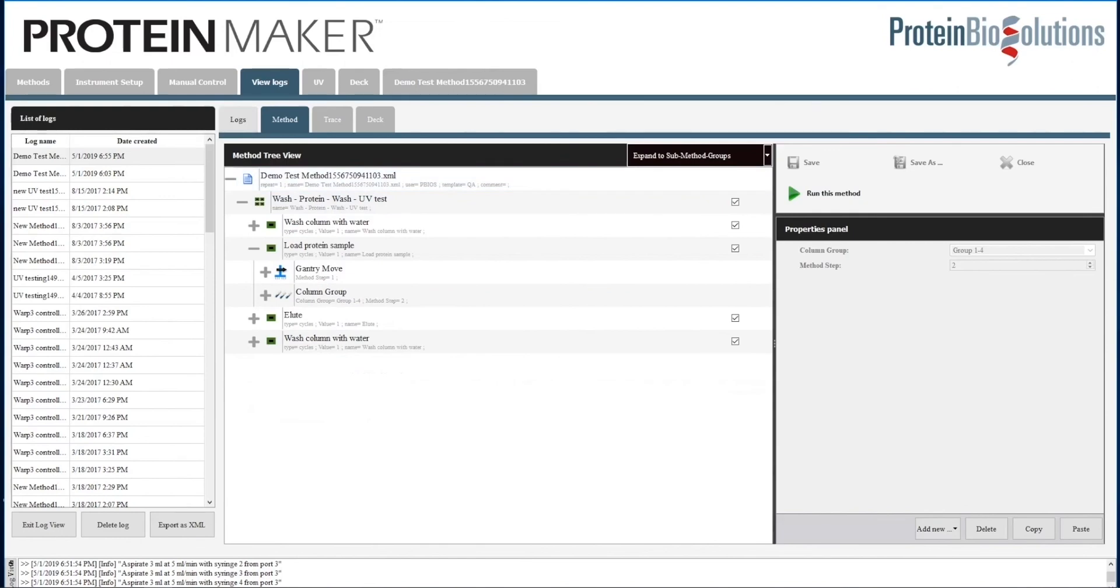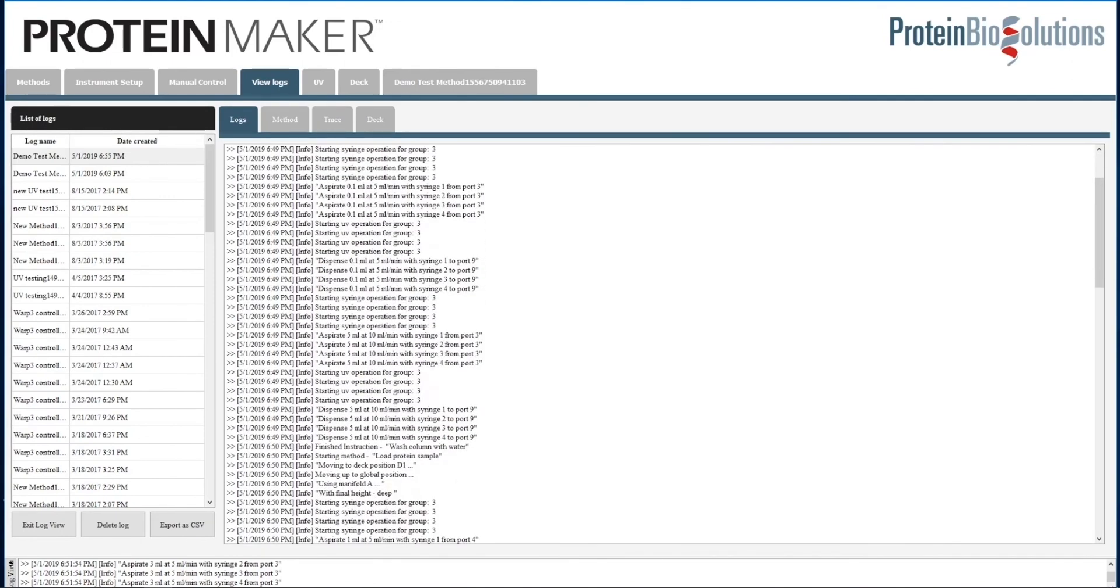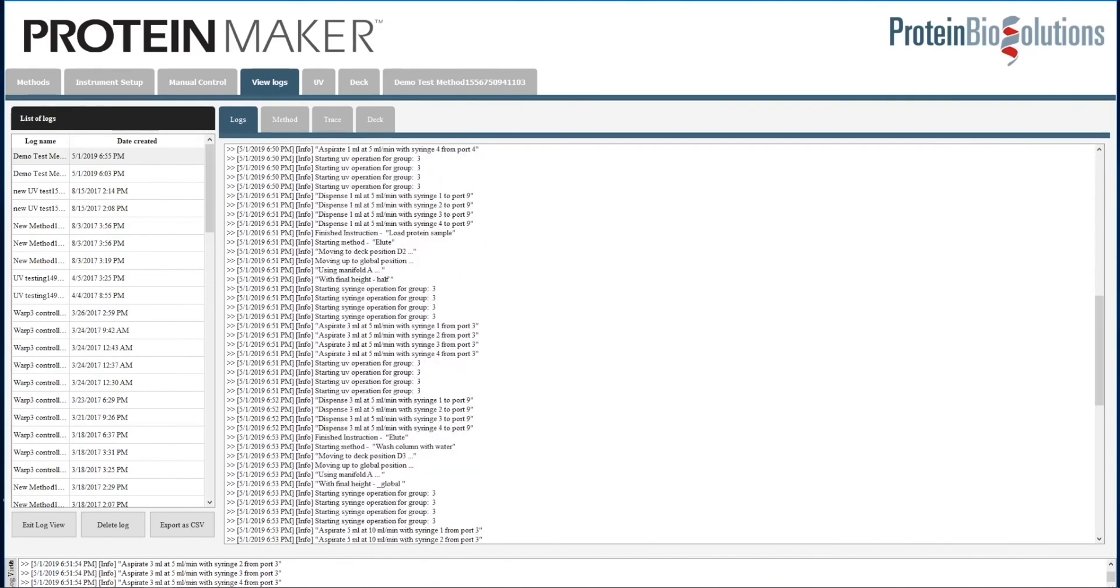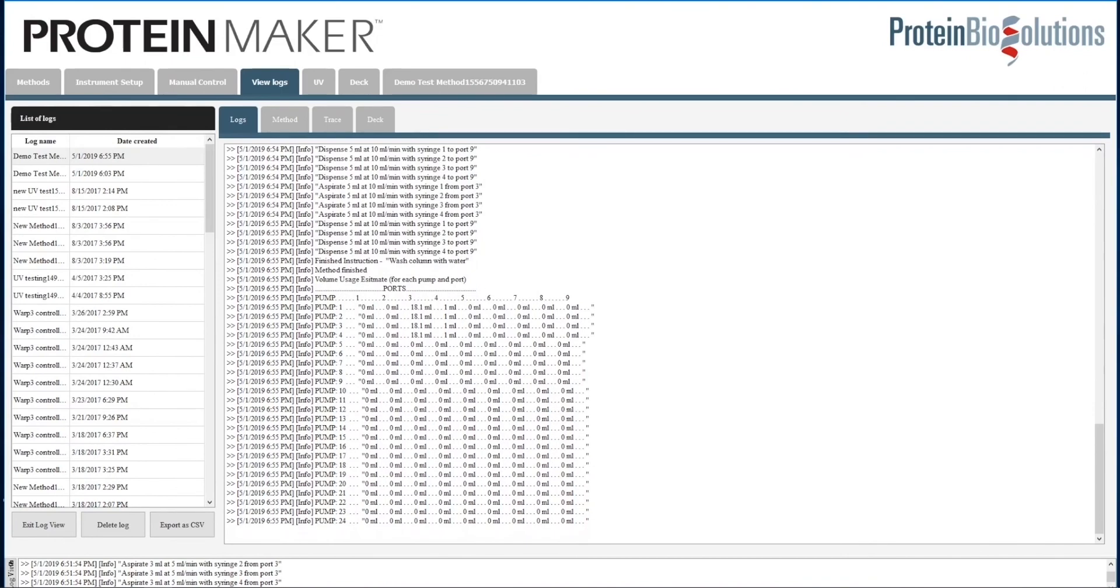Lastly, there is a log that contains the commands run throughout the method. Here at the bottom, it shows how much volume was pumped from each of the port positions. From this, you can determine how much buffer volume should be prepared before starting the run. All you have to do is run the method in simulation first so that it will display this information for you.